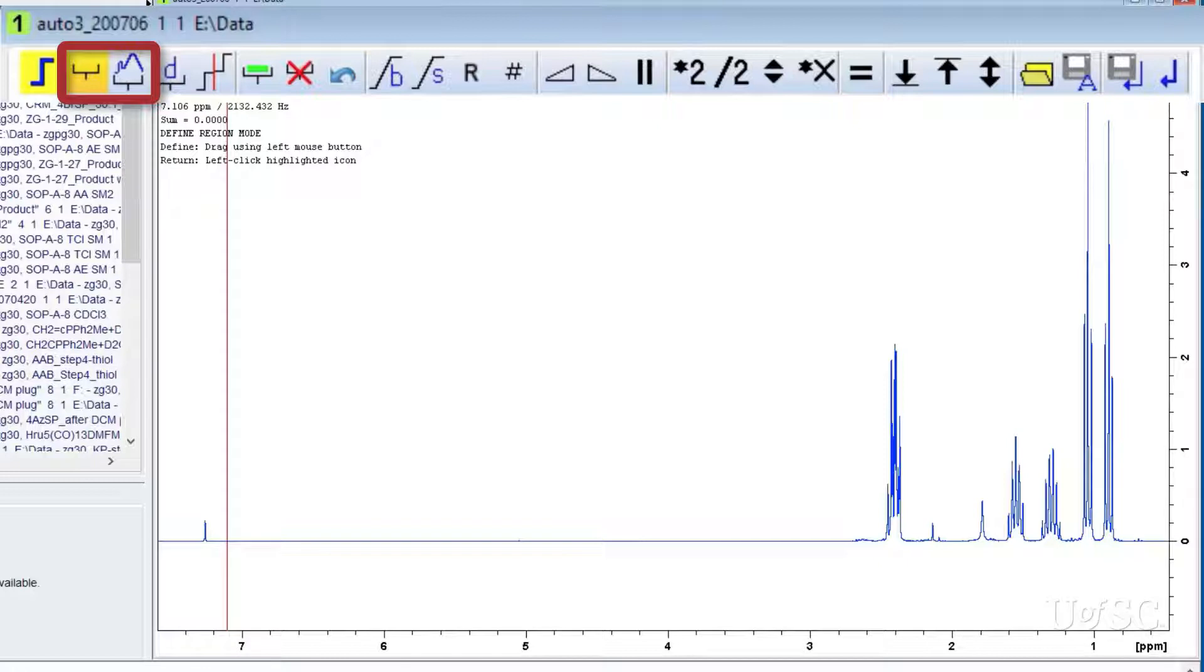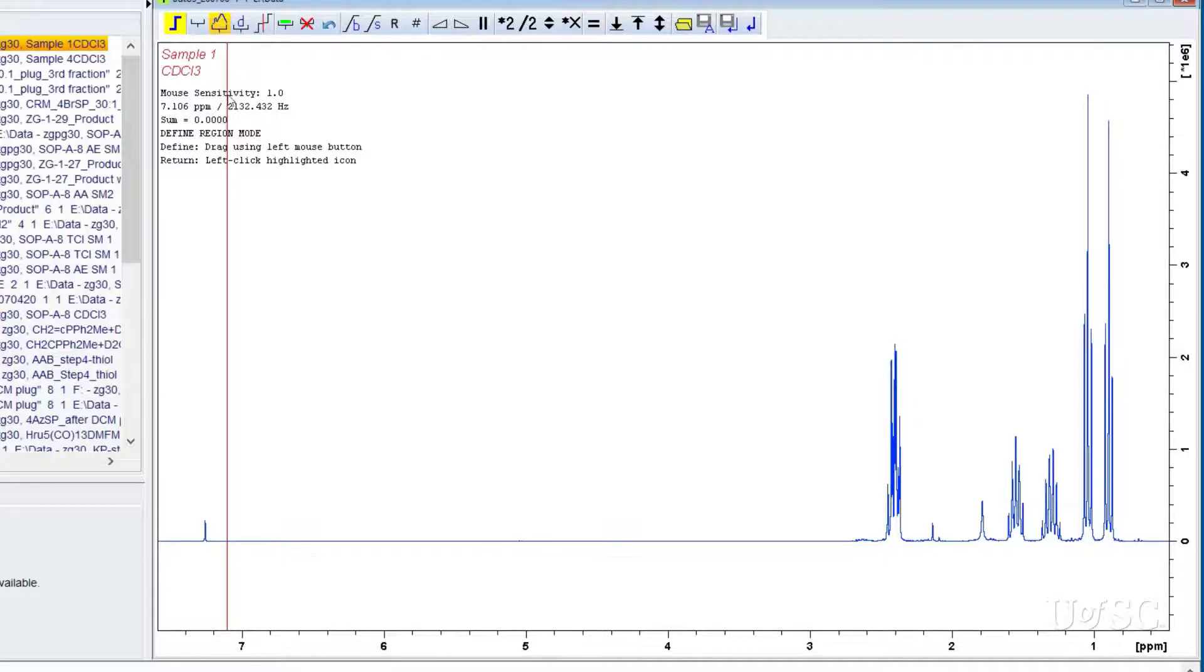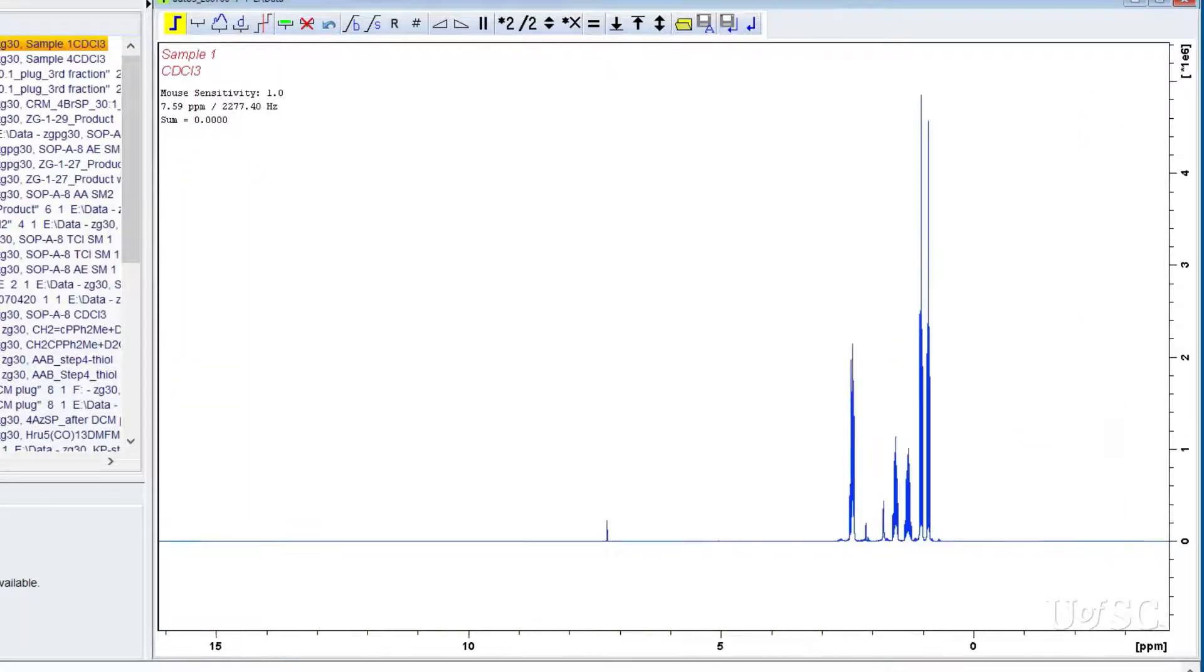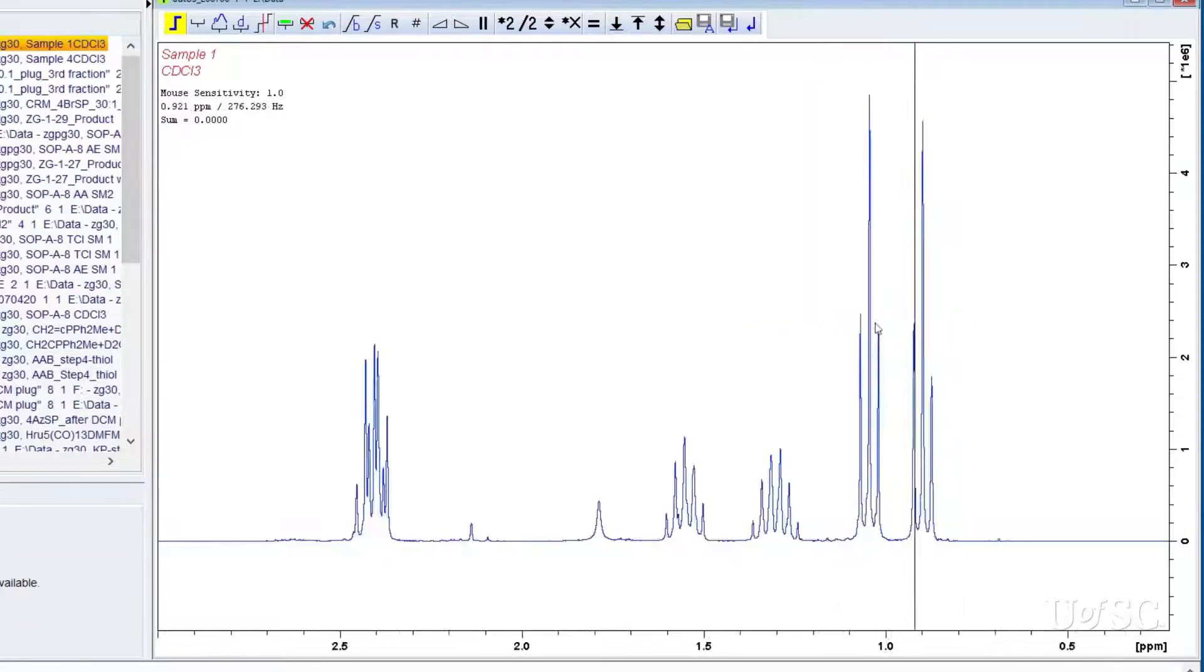It is also useful if the peaks are on a tail of a larger nearby peak. Both icons will turn yellow when their function is active. You can turn them off with a left mouse click. When no tool is active you can use the normal TopSpin expansion tools to adjust the spectrum for easier region creation.